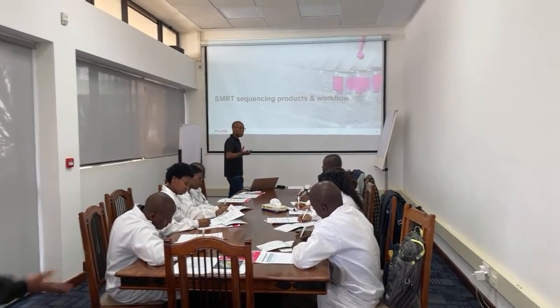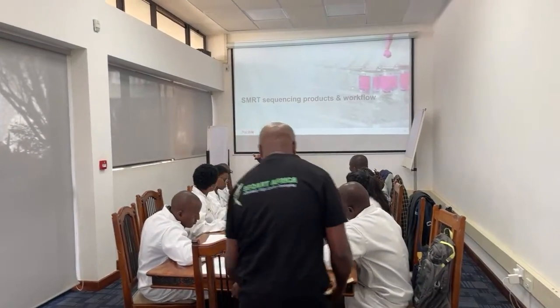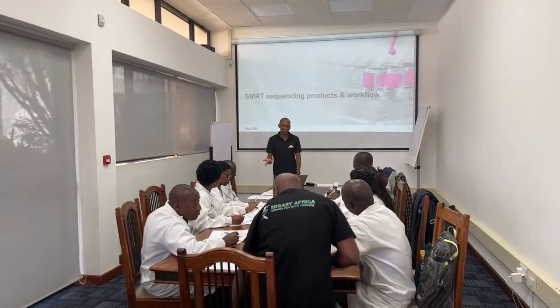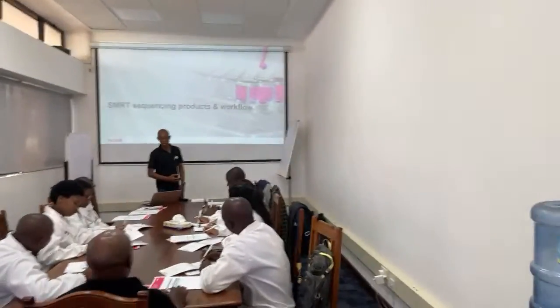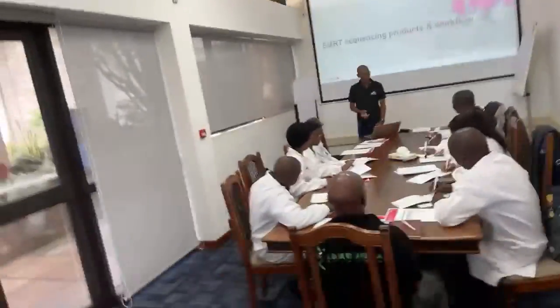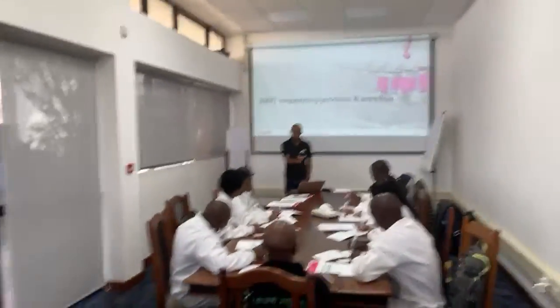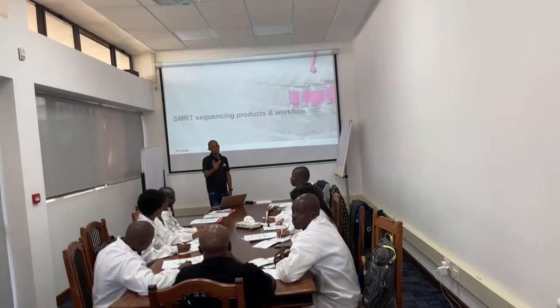So you can imagine, we're going to do a fish today. And when I looked at the genome of a fish, it's 2.4 gigabases long. That's big. So from a SMRT Cell that produces 30 gigs, you don't want short fragments because you're never going to hit the maximum output of the cell. And this is where it becomes tricky if you don't know.